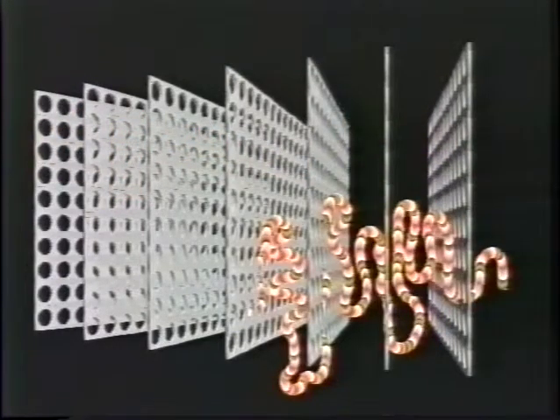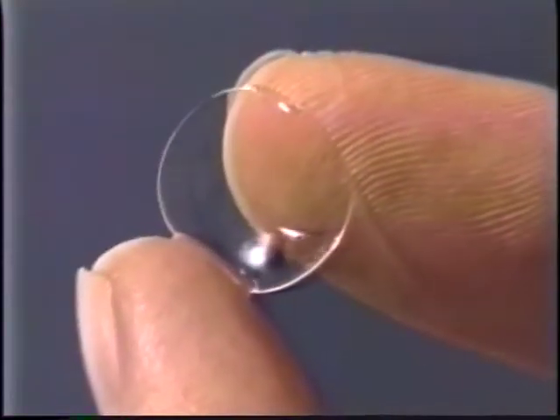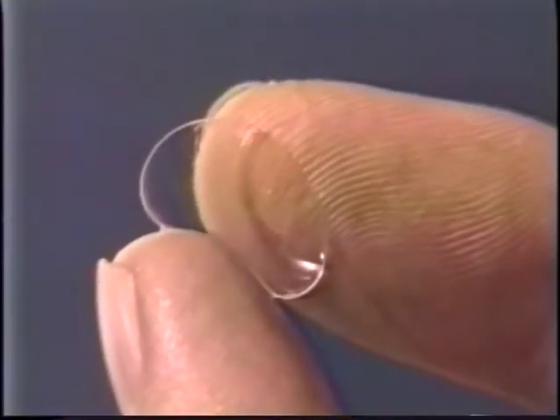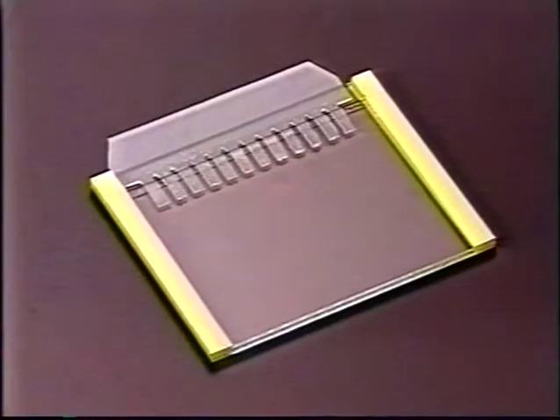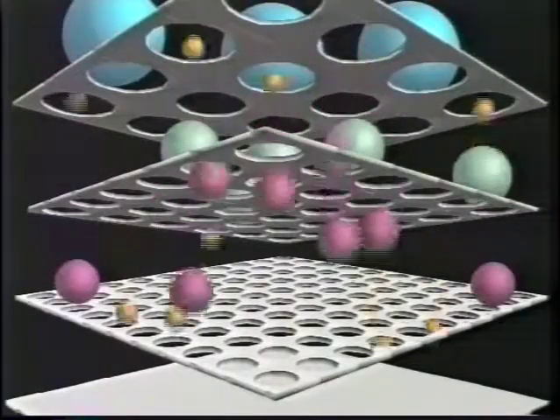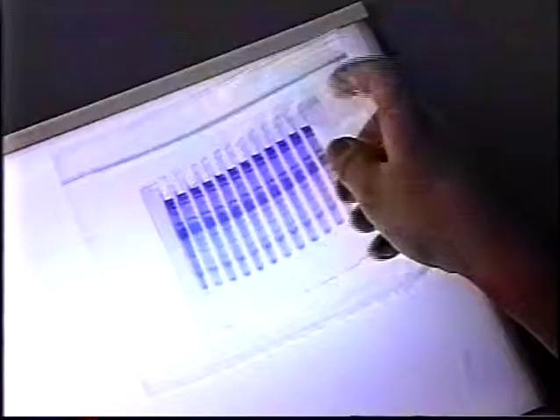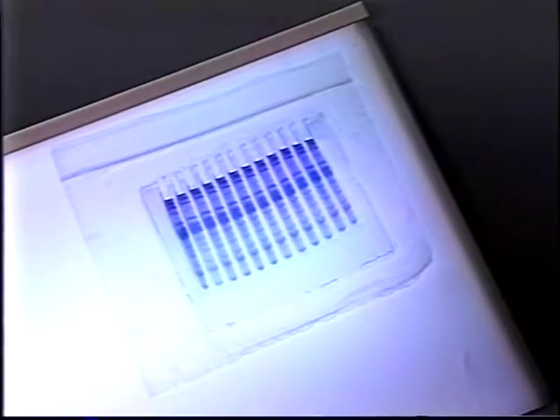acids. The appropriate gel to use for separating protein molecules is polyacrylamide, which is similar to the material used in soft contact lenses. Polyacrylamide gels are produced in precast cassettes. This precast gel is actually a gradient of macromolecular sieves that separate molecules in the 5 to 200 kilodalton range. Polyacrylamide Gel Electrophoresis, P.A.G.E, is the separation method used for polypeptides and proteins, including enzymes.